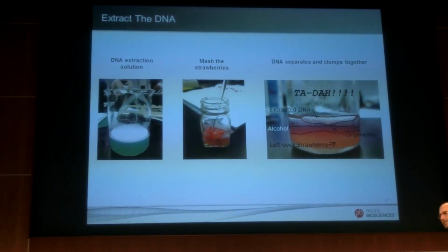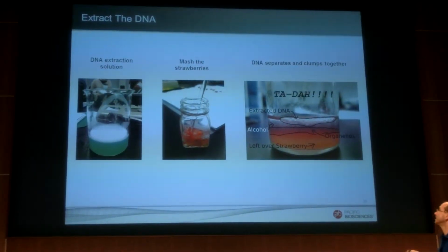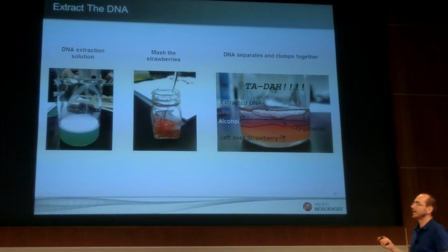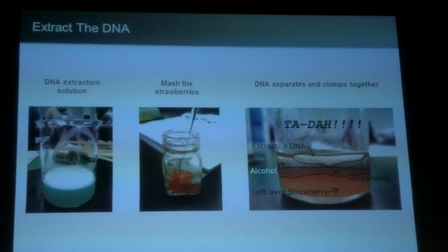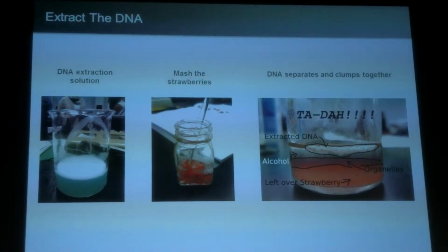So you have to go through the process of extracting the DNA, and some of you may have done this. My daughter just did this in her high school class. In this case, these DNA extraction solutions are open on the market. You can get them for the human genome, for different plants and things. There are different types of extraction solutions.